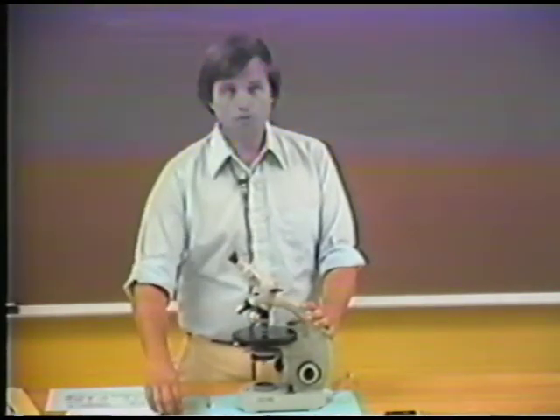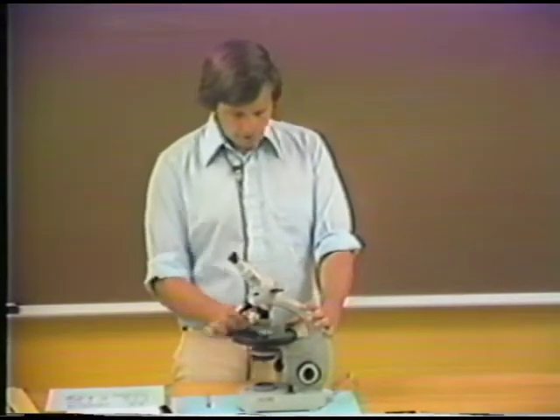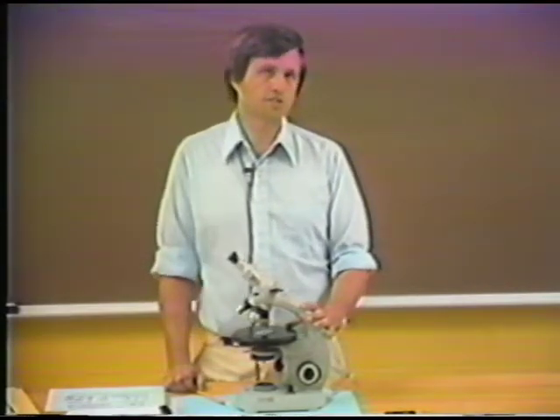Well, let's look at the same kind of interference figure now for the mineral calcite. And the feature of calcite that's important here and that influences the character of the interference figure is that there's a very large difference between the omega and the epsilon refractive index. And so we see here now with the centered optic axis figure a very large number of color curves. And this is due to the very high birefringence of the mineral calcite.